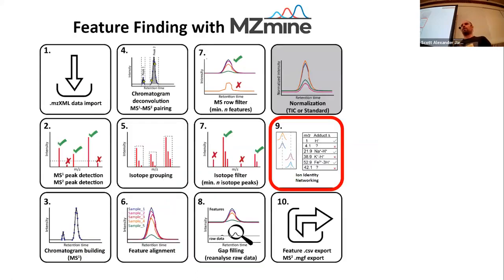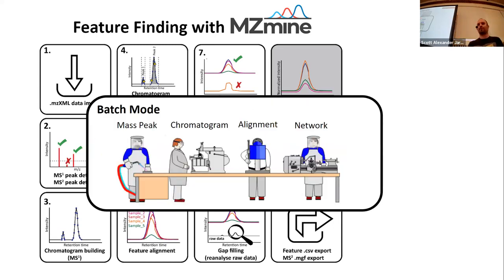Okay, so now what did we do with this MS1 data? There's this MS2 level, and then there's this MS1 level. Yesterday, Stefan and Robin walked you through these different steps and a lot of settings in MZmine. Eventually, thanks to the batch wizard, we could create a hopefully simplified version of all these different steps of raw data processing.